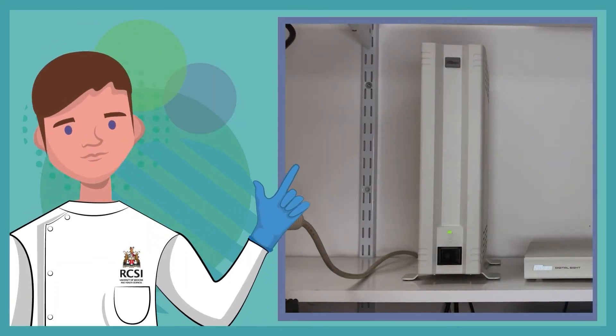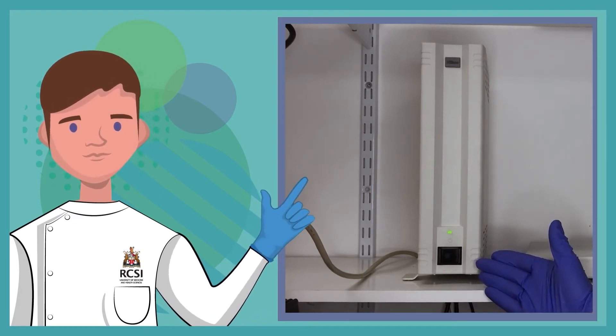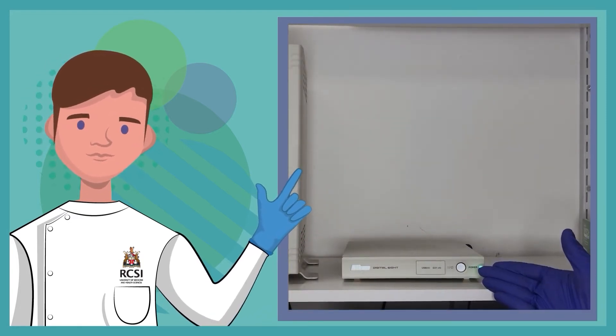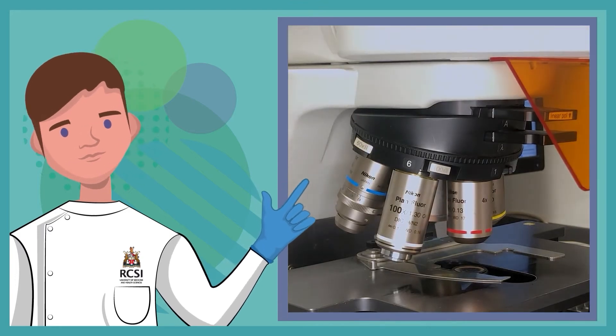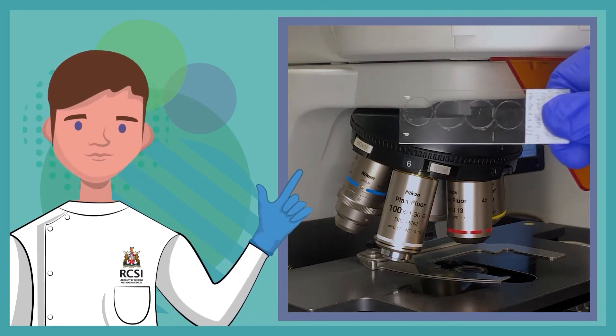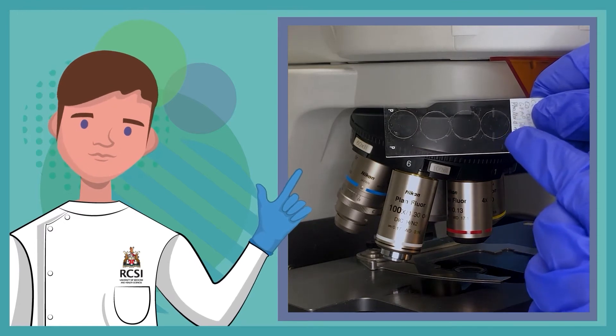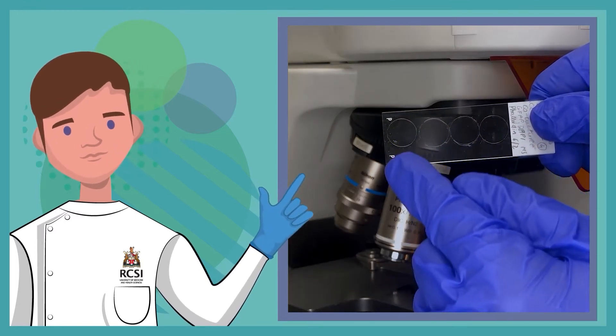Two other modules that are important are both the power source for the microscope itself and the power source for the camera. The sample we will look at today is a slide mounted with cover slips that have had cells grown, fixed, and immunostained on it.